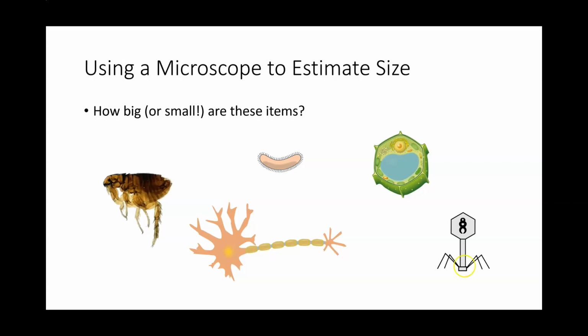But can you describe the flea in terms of centimeters or millimeters? Is a bacteria bigger or smaller than a virus? Which is bigger, a plant cell or an animal cell? These are questions that a microscope can answer. So let's see how we can measure using a microscope.